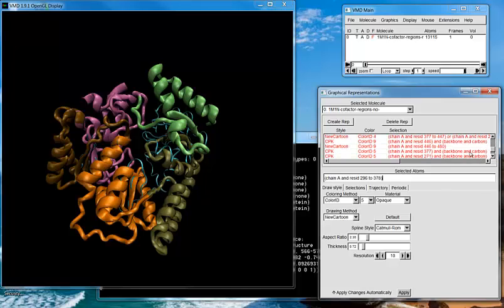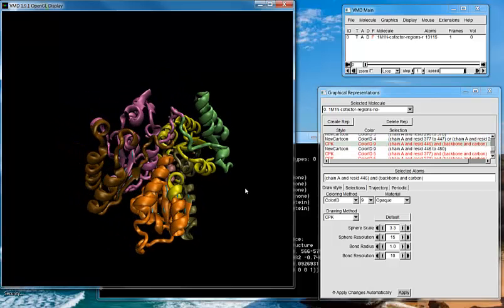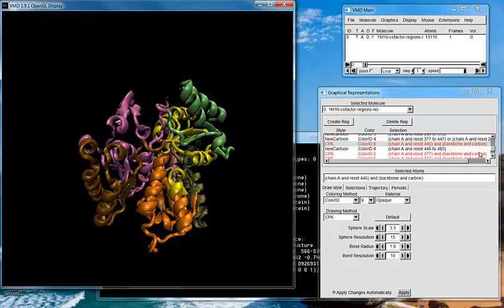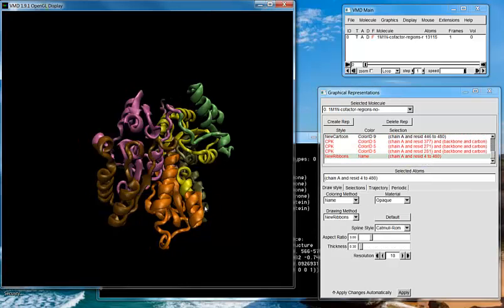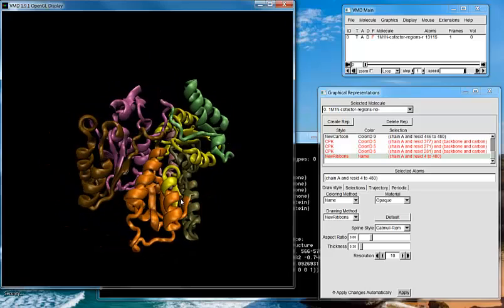then slowly we would replace all of this background. You don't need to show the CPKs. But now if you look at this, you can see that everything that was being shown here with this wire model is now covered in the various components. And this is one of the things I did to break this up.